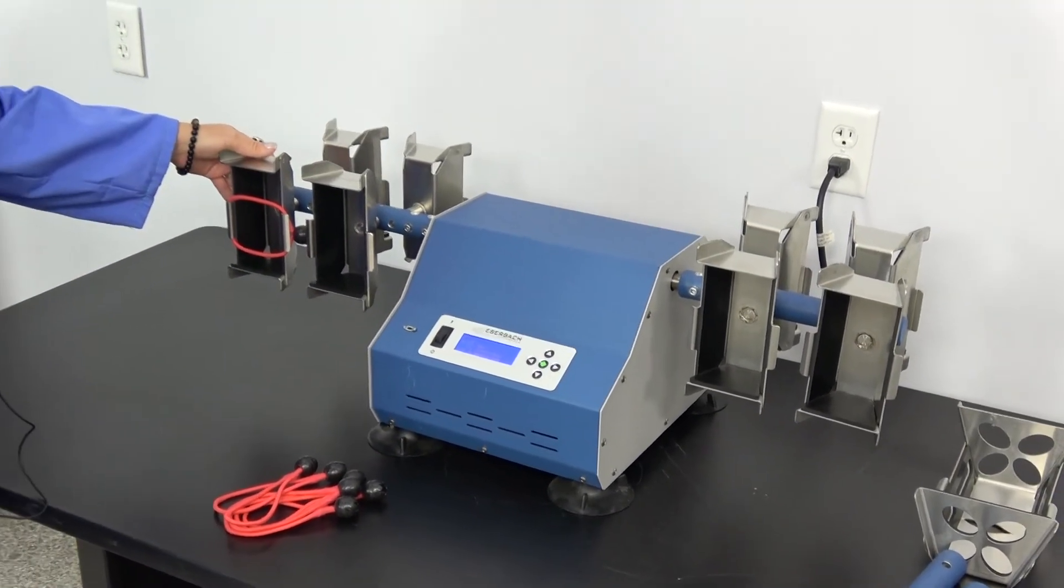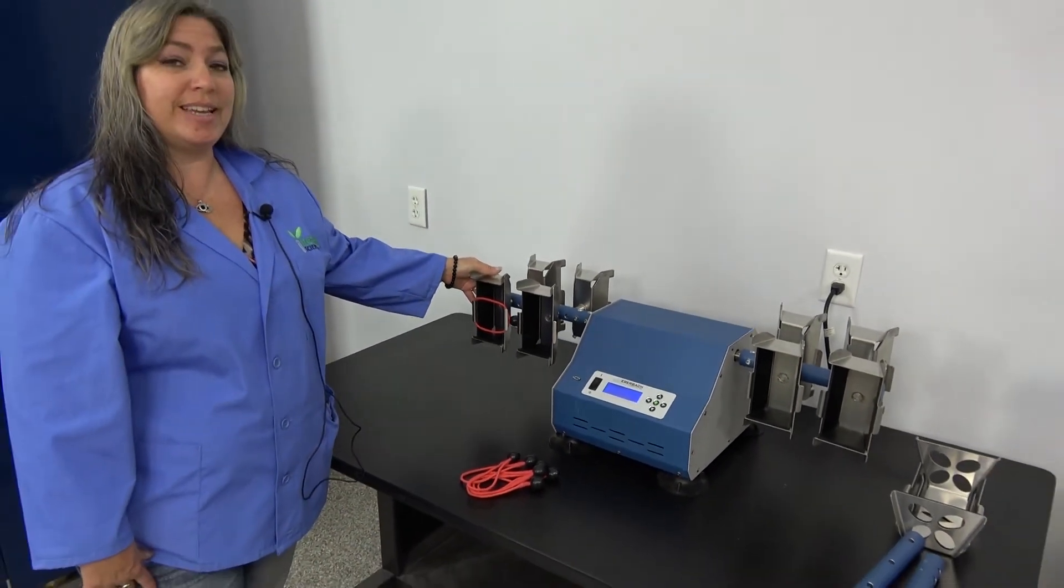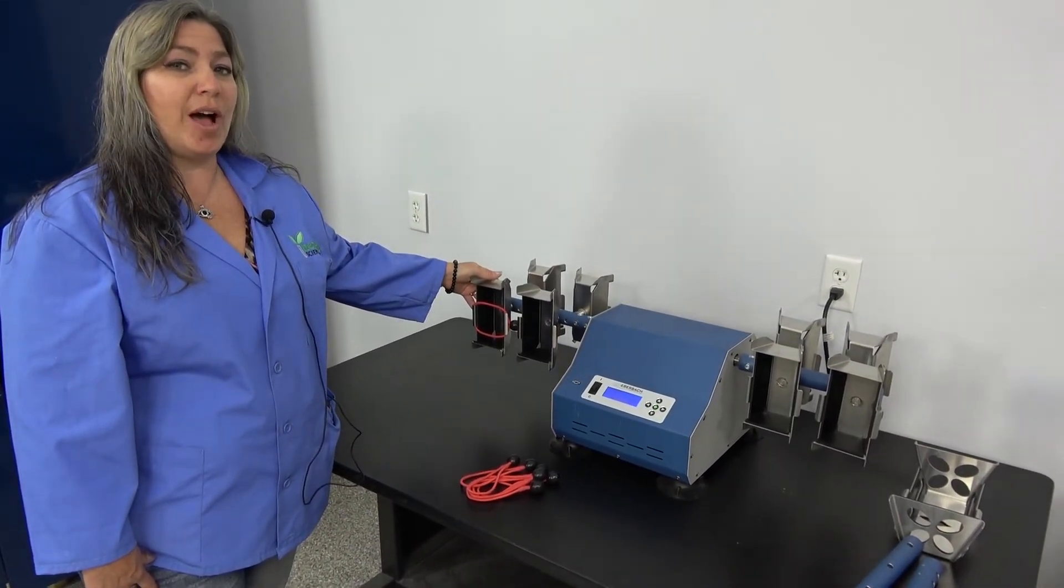This unit, as well as all of our working units, are backed with our 90-day warranty, and it is on hand in our Cridersville, Ohio facility.